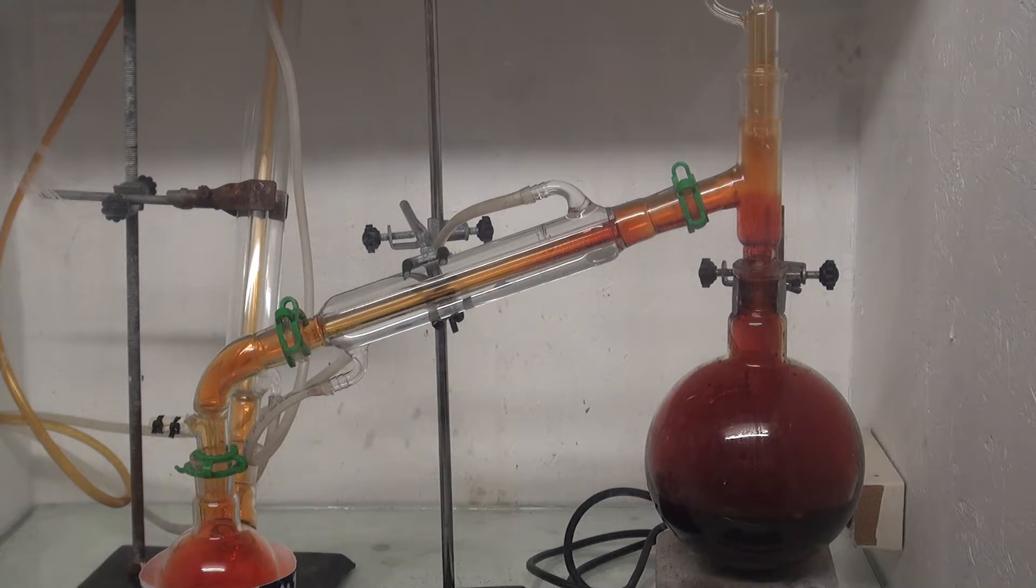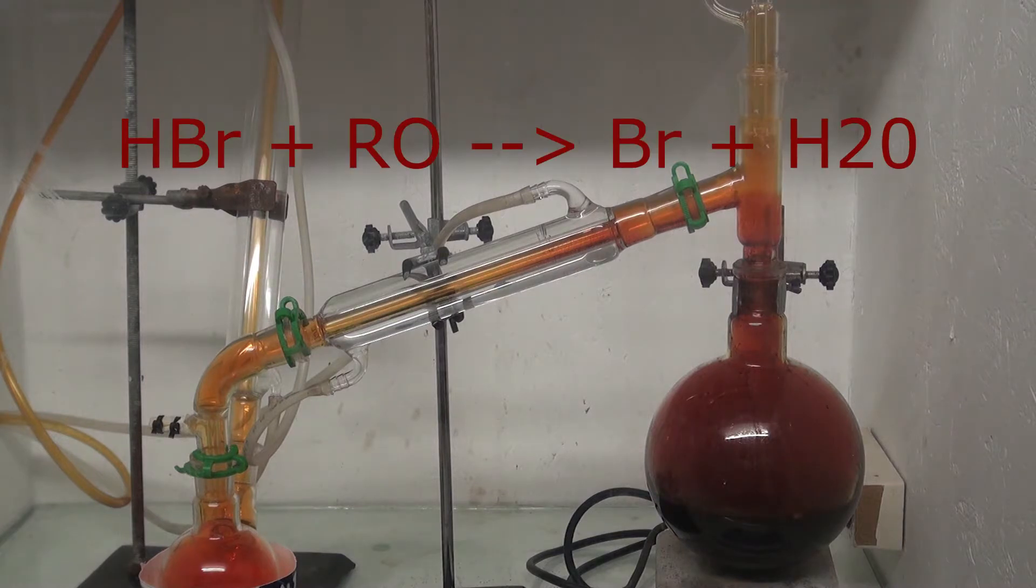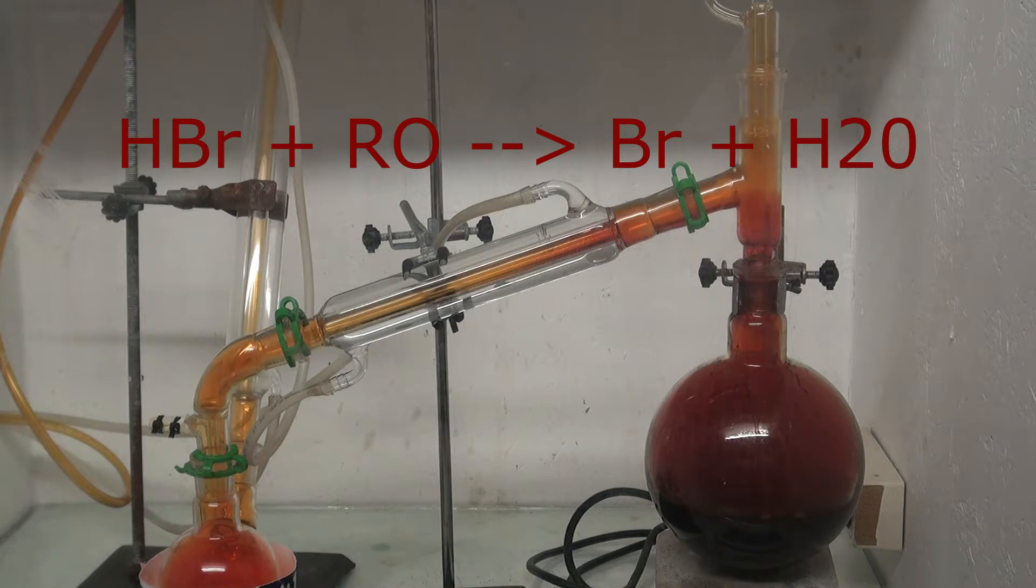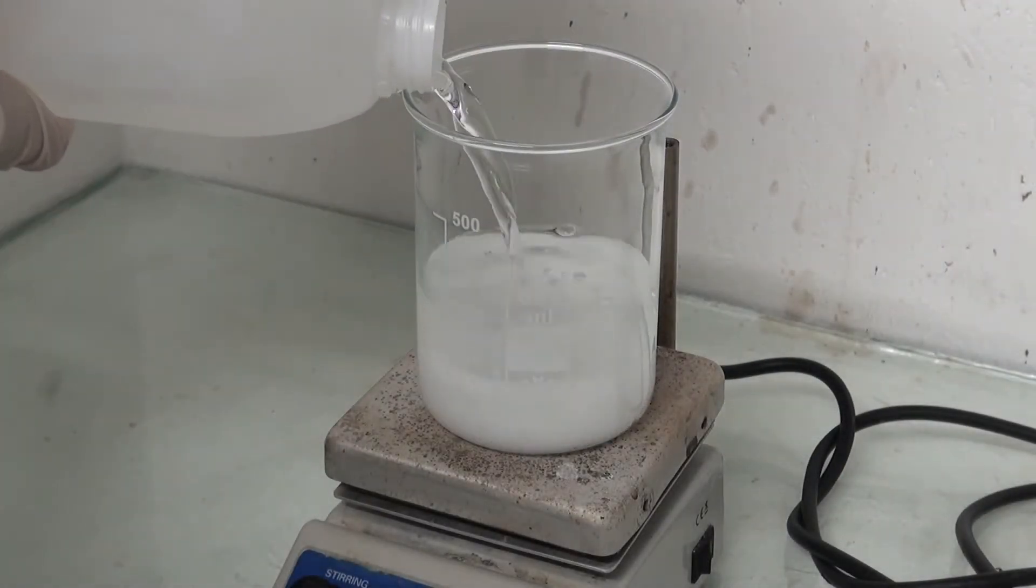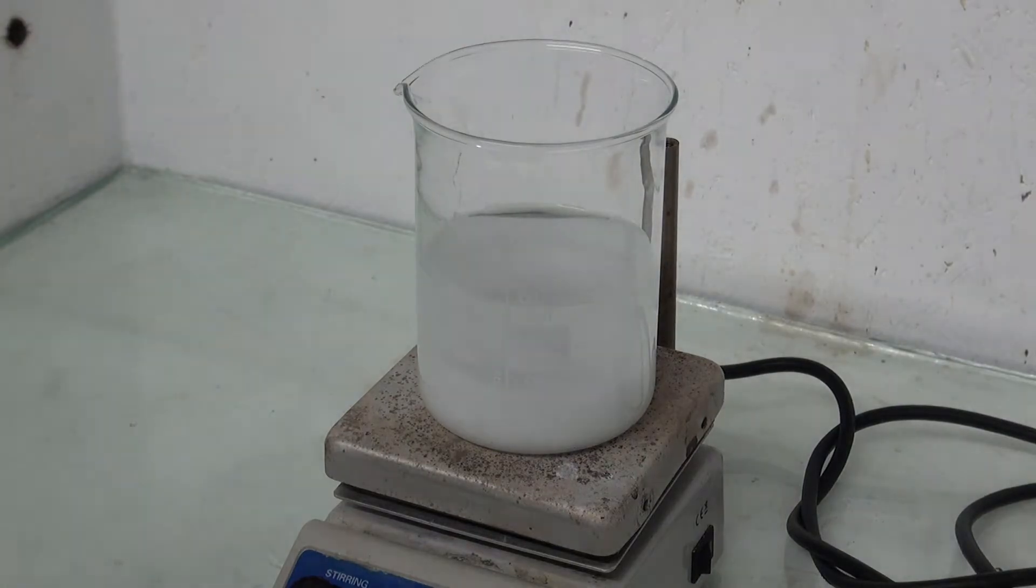In today's video I will make elemental bromine. Bromine can be prepared by the oxidation of hydrobromic acid. Hydrobromic acid can be made by reacting a bromide salt with a strong acid. For educational purposes, I dissolved 2 moles of sodium bromide in water.